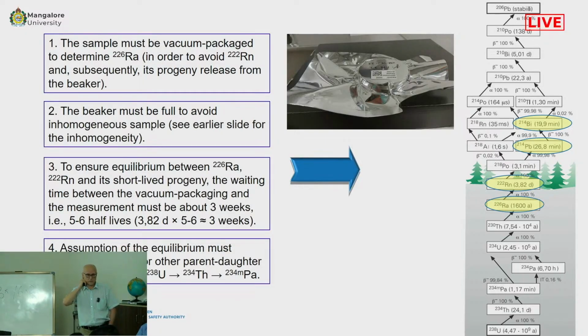Why 3 weeks? The reason is this one. Half-life close to 4 days. We want to have equilibrium. This is the reason here.